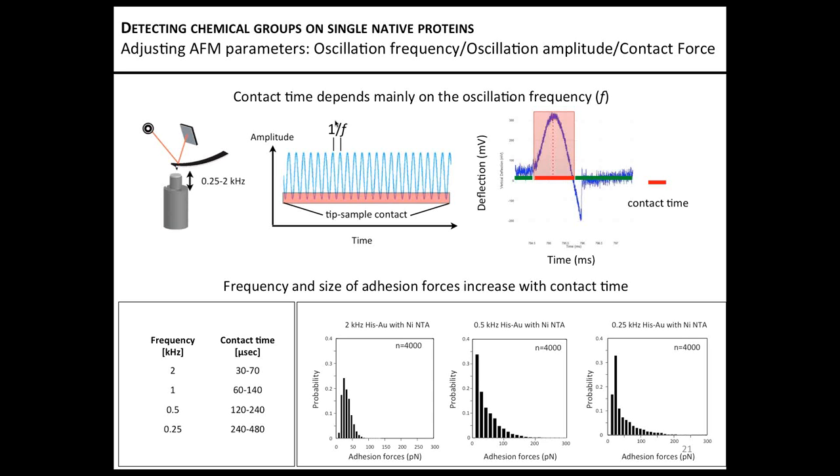I would say for high resolution imaging you will try to have a linker as short as possible, but also as long as possible to identify specific interactions. So I guess the length would be about 15 nanometers. Lower, I think, for high resolution. In fact, here we don't have any linker, it's just 3 units. We try to avoid such a linker because otherwise we lose lateral resolution.